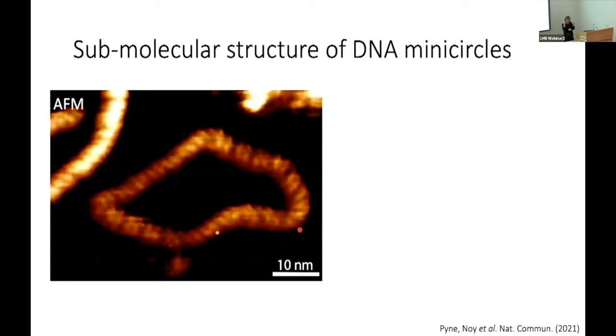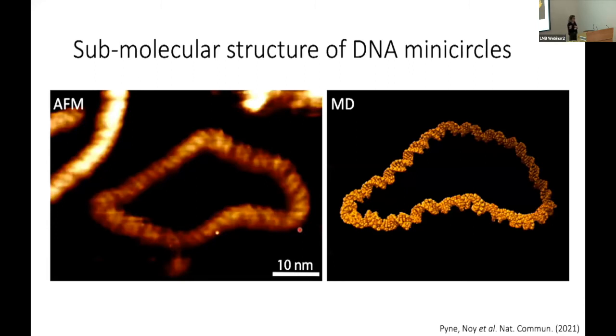You've got a length over which the DNA basically wants to be straight. So you create a planar molecule. And if you're going to put something down on a surface, making it planar first makes that a lot more straightforward. It also had the added advantage that our wonderful friends could simulate these in all atom MD simulations in explicit solvent.